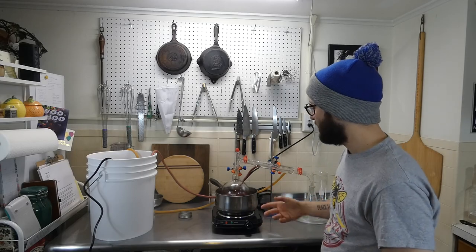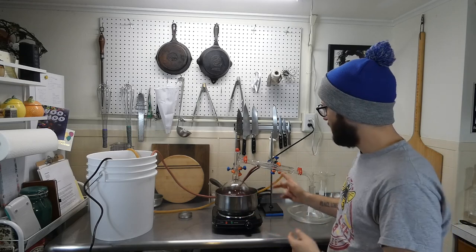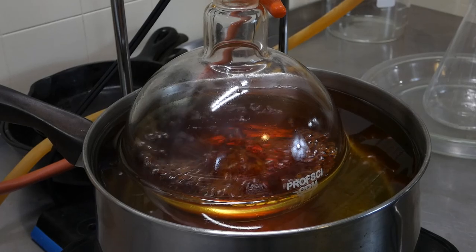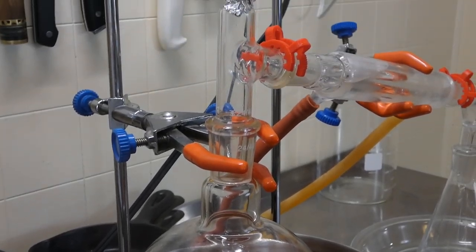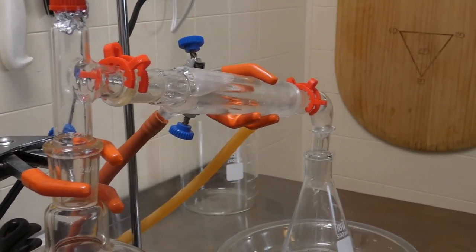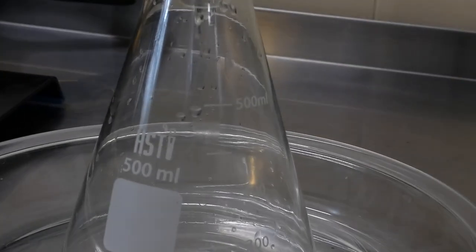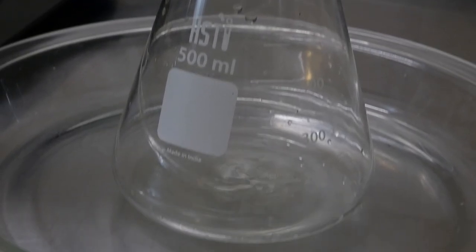I'm going to let this come up to temperature. Once it starts doing its thing, I'll bring you back and we'll have a peek and I'll show you how it's working. Alright, it just began to boil. The steam is starting to work its way up into the distillation arm and into the distillation column. As you can see over here, the ethanol has started to come out, and it is dripping very quickly.